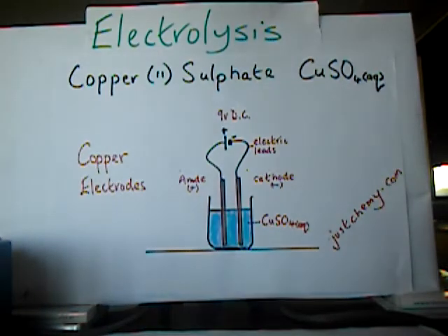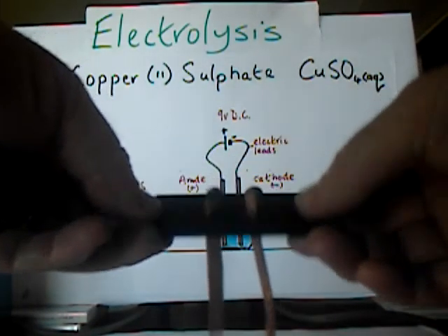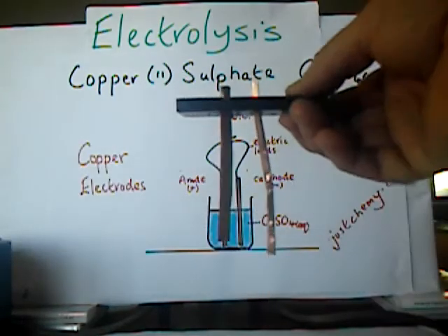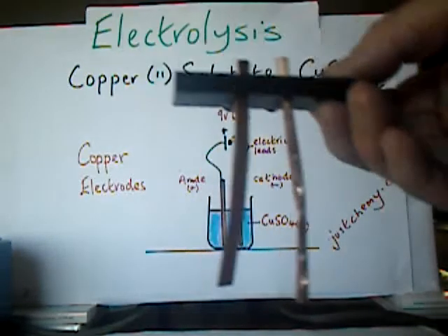And I'm going to use this device here for my copper electrodes. So you can see my copper electrodes as they are at the start.